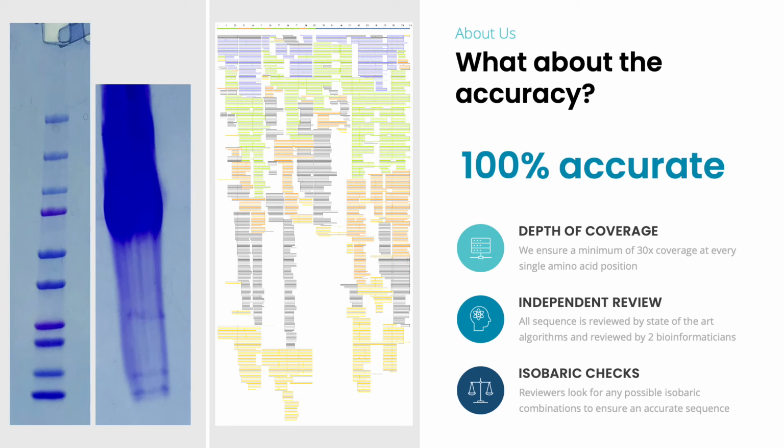So take, for example, here, the gel on the left. This is not something that we want to see all of the time. It was a bit of a bizarre situation, but I think it illustrates exactly the work that we can do. So it came from a postdoc that was trying to wrap up some of her work before leaving the lab, and she was quickly running out of antibody. The cell line was long gone, and she was down to the last few micrograms of the actual antibody. And that's when she reached out to us.